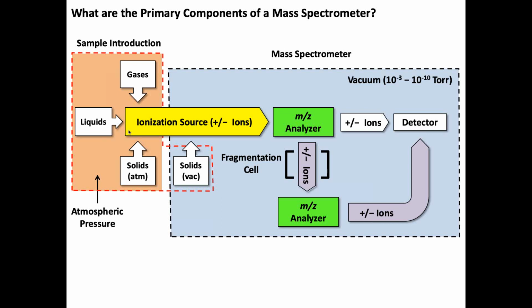So really the first 75%, if you will, of mass spec's history was focused on those low molecular weight species, and that kept biological mass spec, as we know it today, from developing. Then with the development of ionization sources, electrospray and MALDI, which we'll talk about, the ramp up in mass analyzer development really kicked into gear. The companies got really involved, there was a lot more money involved, and so you start spending a lot more on investment.